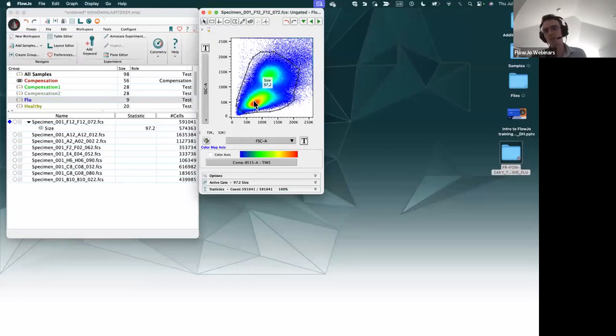The yellow is a lower density area, so there's less of the cells in that yellow region. Then there's green, which is a pretty low density area, and then blue, which is just basically the outliers. Most of our data is right here with our lymphocytes or up here. So the pseudocolor plot's a very nice way of understanding where the cells are located within this two-dimensional plot.